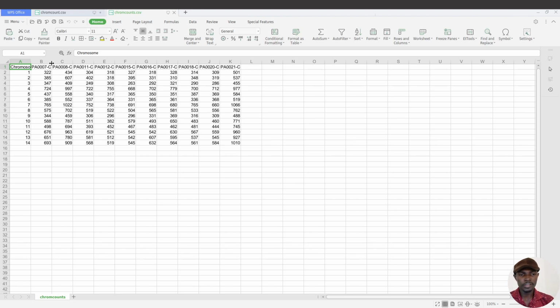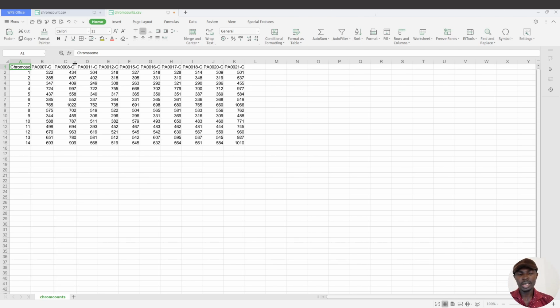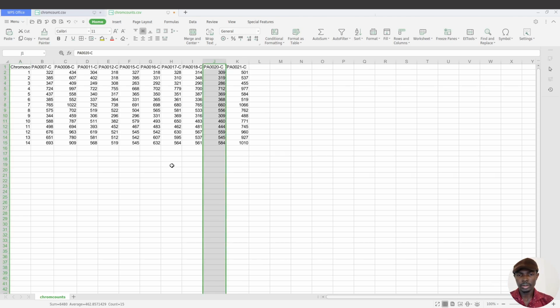But what we have here is very simple. And so when you have it like this, it becomes easy to interpret, easy to explain, easy to present, because now everything has been simplified for you. You can also compare the samples to each other, chromosomes to each other, and stuff like that. But everything here looks cool. Okay, so that's it for the first approach.